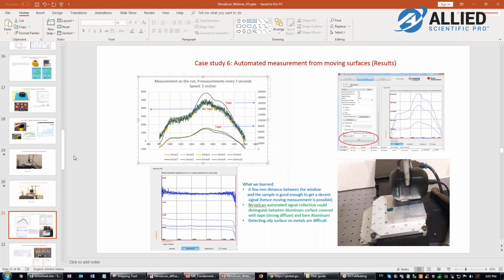Yeah, we didn't. The only quantitative measurement that we made was from the wheat kernels. We normally leave the quantification part to the customer to do. They have to do their calibration themselves. So I could not tell you what the minimum detection limit is in this case.